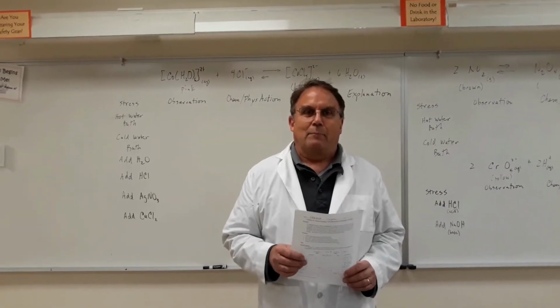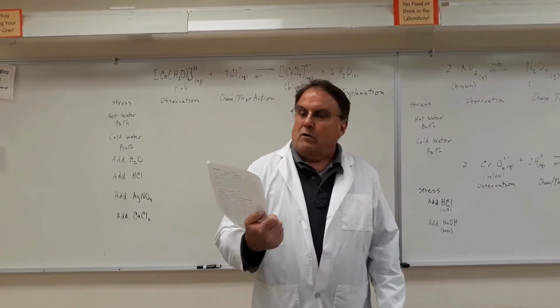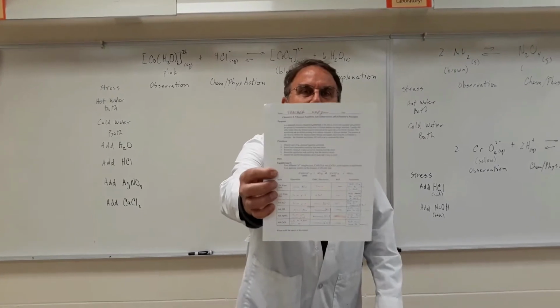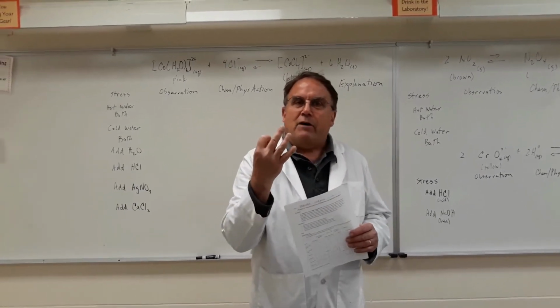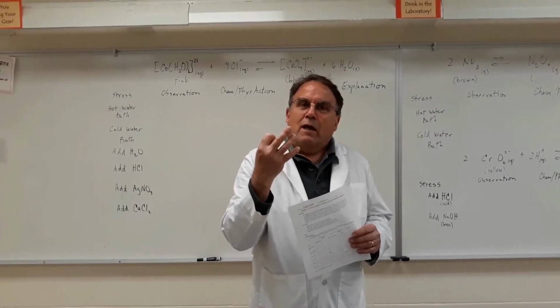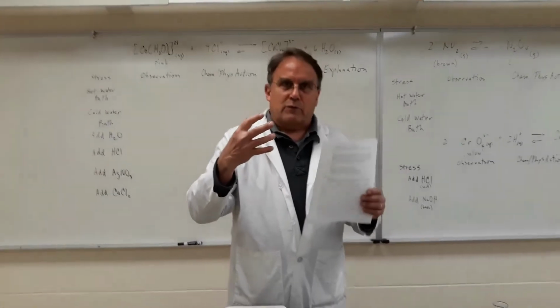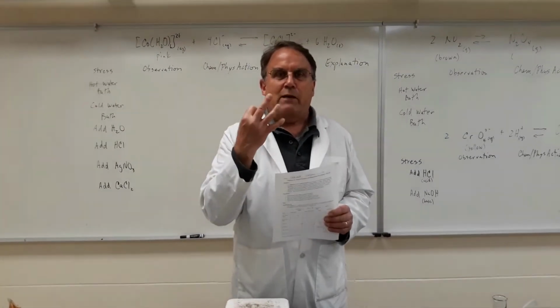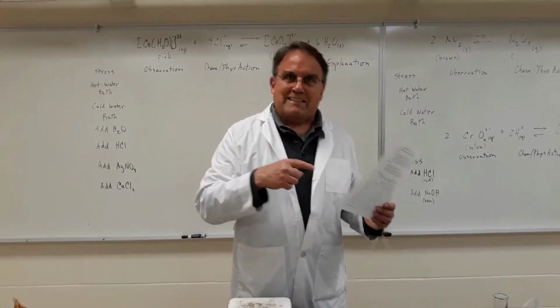Today's video lab is more of a demo lab, a chemical equilibria lab with observations of Le Chatelier's principle. When you shift an equilibrium, there are three different variables, three different stresses. Think to yourself, what are those three things? We're going to be doing those three things to these various equilibria. We have three different equilibria and various shifts, things we can do, and you'll be able to see the equilibrium shift.